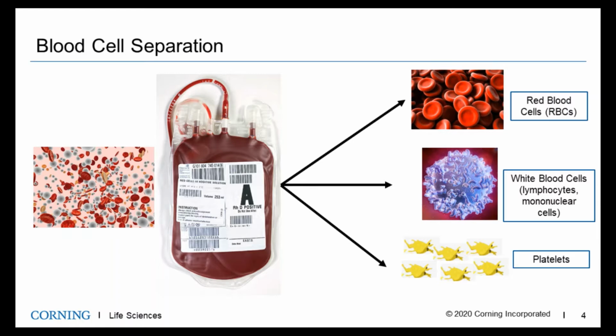In the cell therapy space, blood and other blood products like apheresis, cord blood, bone marrow, etc., are common starting materials. Oftentimes, only a specific component of the blood is desired for downstream processing, and thus there is a need to separate the blood into its various components, often going so far as to progressively select out very specific cell types.